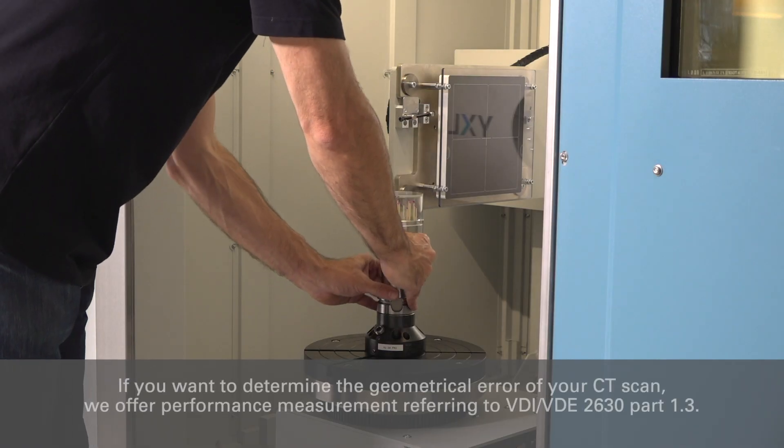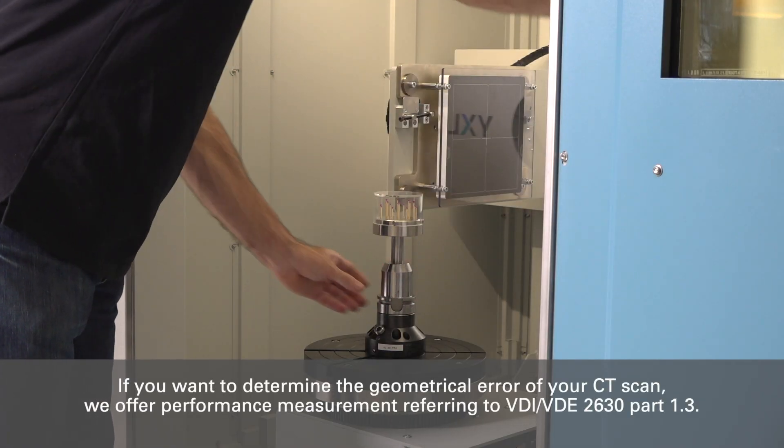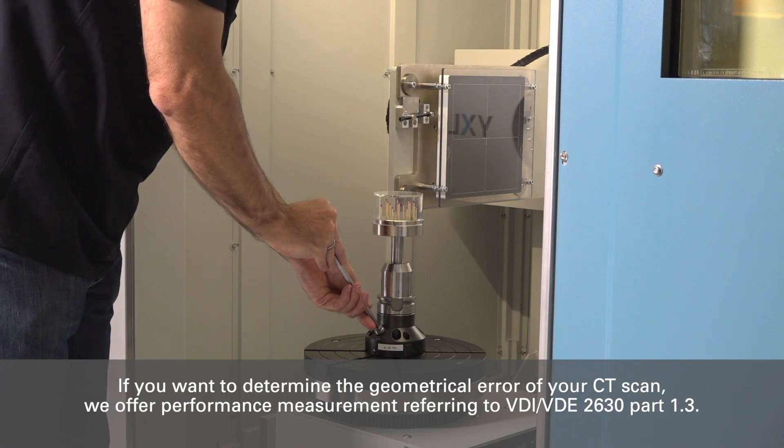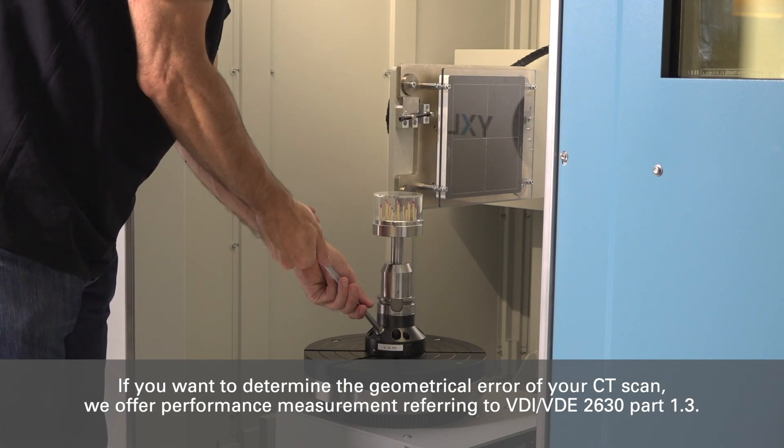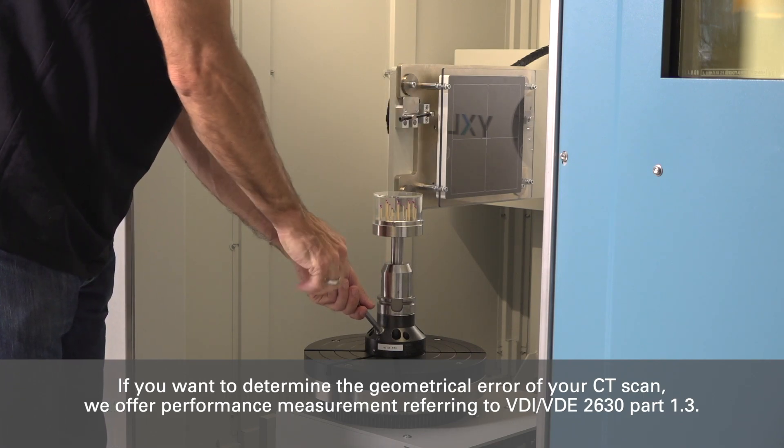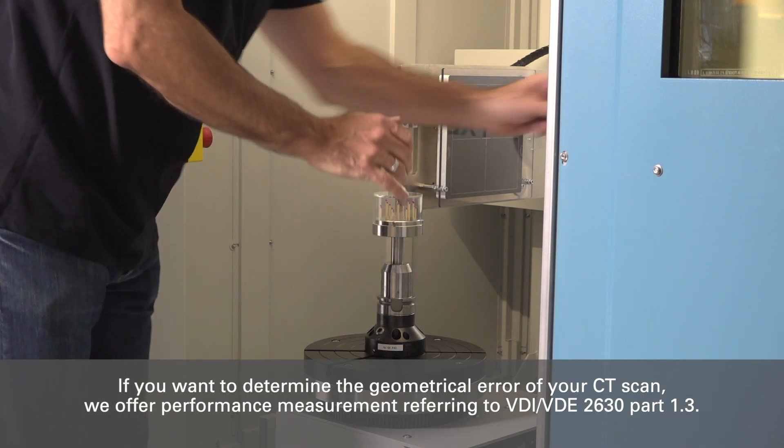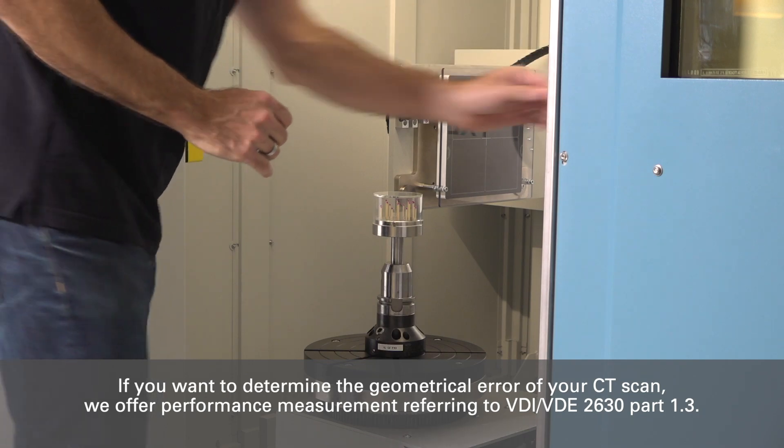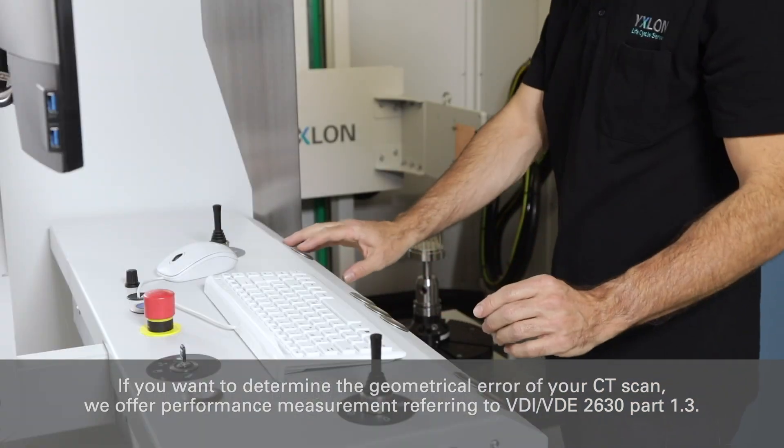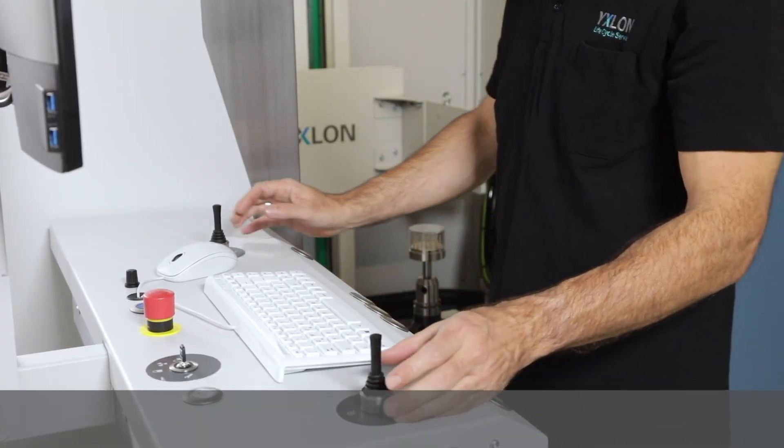If you want to determine the geometrical error of your CT scan, we offer performance measurement referring to VDI VDE 2630 Part 1.3.